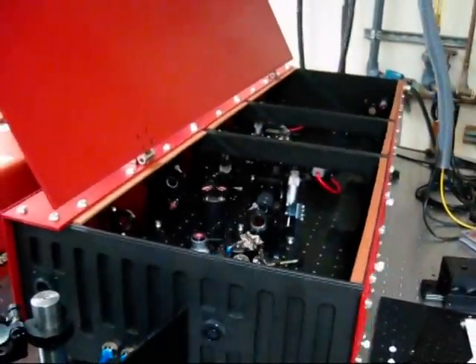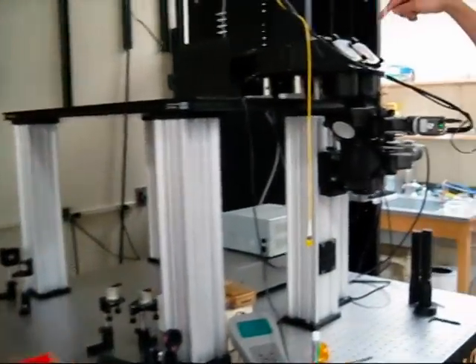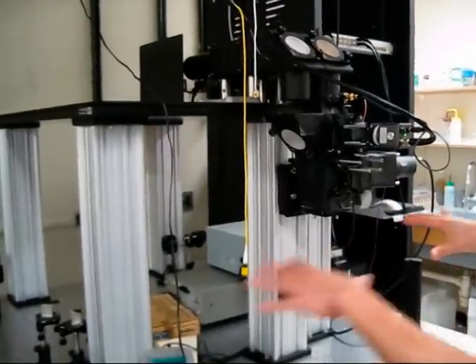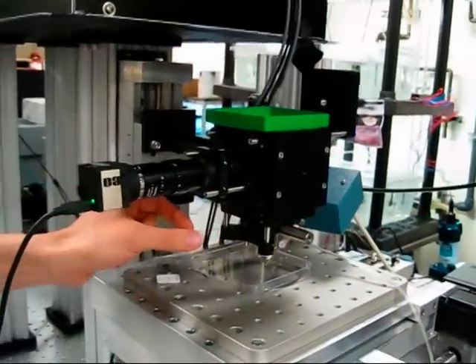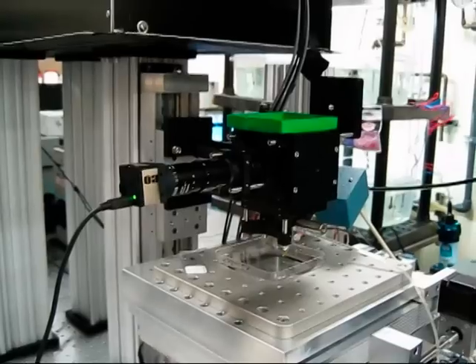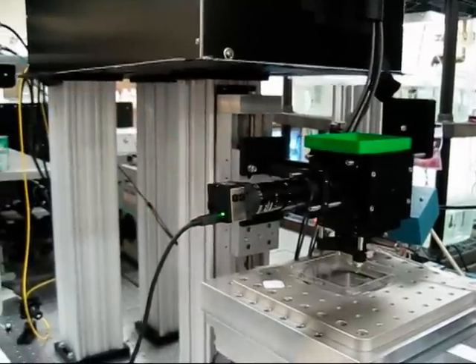From here the femtosecond pulses come up through the scanning system and are scanned across the sample. We've removed the microscope stage right now but the finished product will look somewhat like this. The objective lens is here, and that's really the only functionality. This happens to be a single photon system, so we have a 473 DPSS laser scanning the sample.